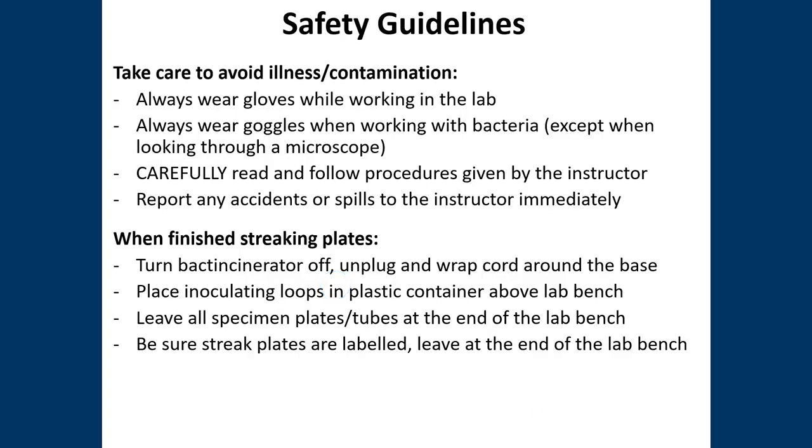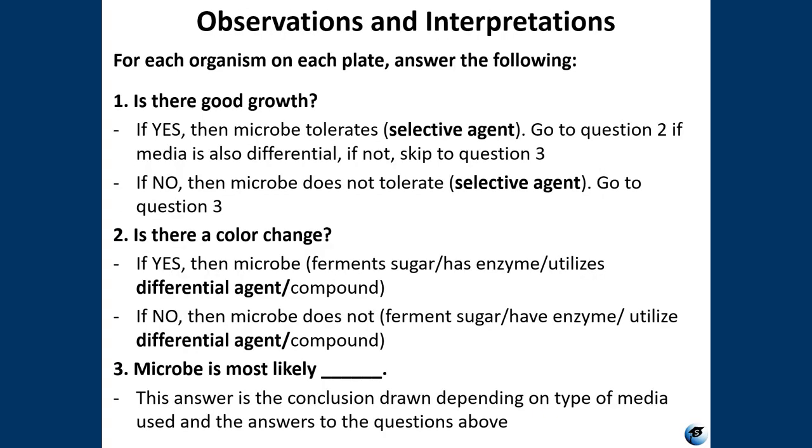What we're going to do is, I'm going to skip ahead just a little bit. We're going to determine if they have good growth and if they had a color change. And then based on the answers to those 2 questions, we're going to describe the microbe. If you have good growth, sometimes it is difficult to tell. If you can't tell if your growth is good, then you would compare it to how it looks on nutrient agar because that's a general growth media.